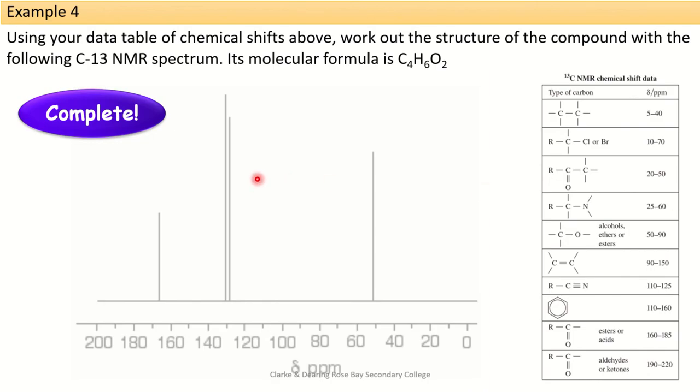So what I want you to consider here is we have this molecular structure, C4H6O2. What's the most appropriate structure based on this peak? Pause it here if you want to have a go. If not, please follow on after this.